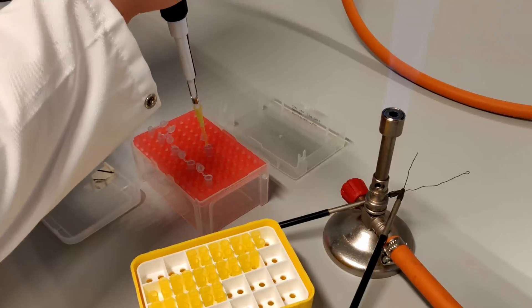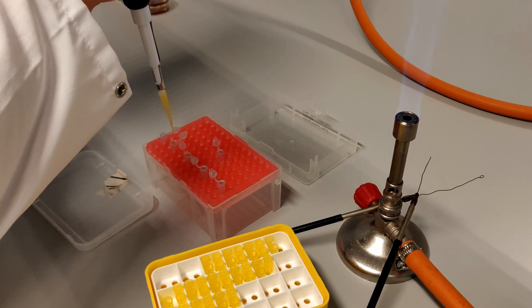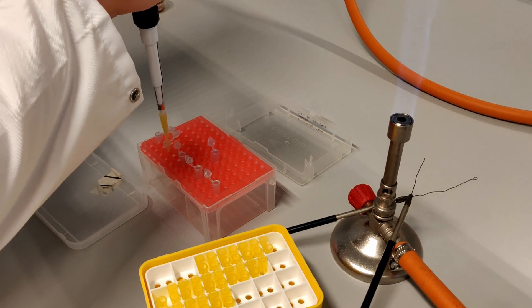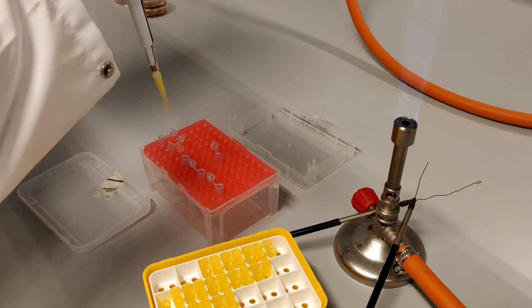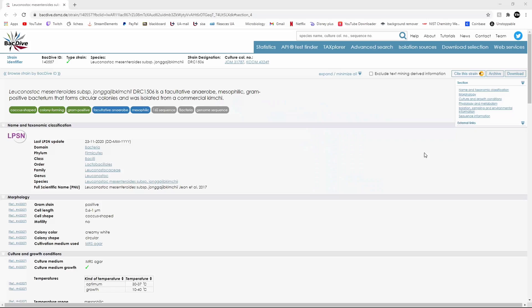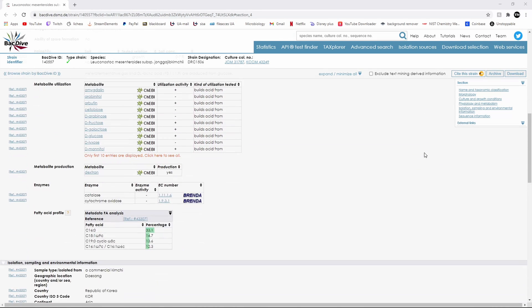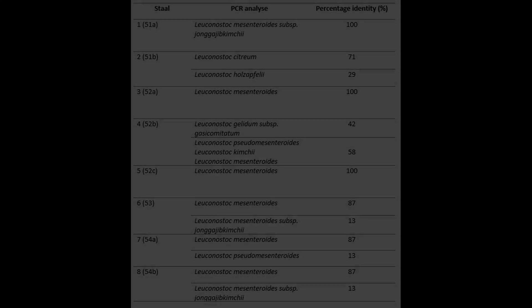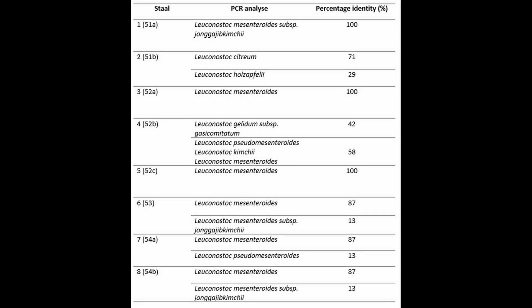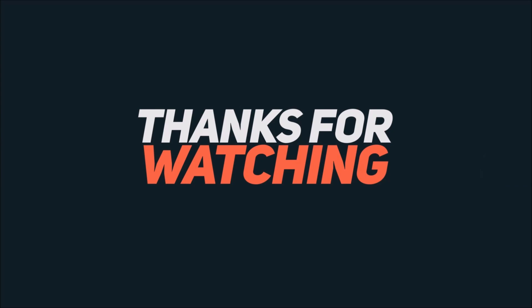Then you add the master mix, which contains all the reagents for the PCR reaction except for the target DNA which is in the bacterial cells. Then place the tube in the PCR device, after which the colonies will be identified by comparing with databases. How this identification works I will cover in a future video. When obtaining all the results we can compare if the different methods agree with each other and if they do, you can be pretty certain the identification is correct. Thanks to the University of Antwerp for making this video possible.